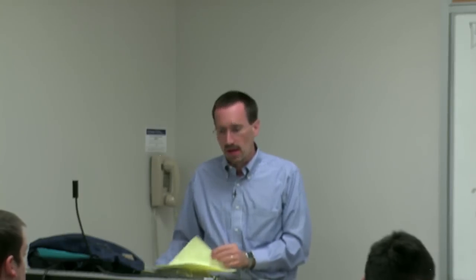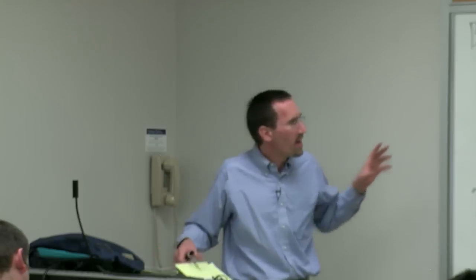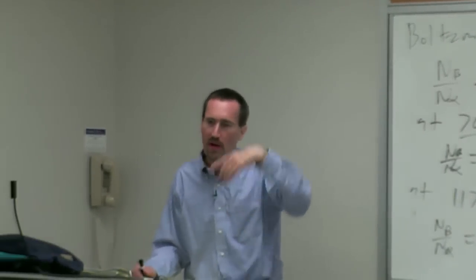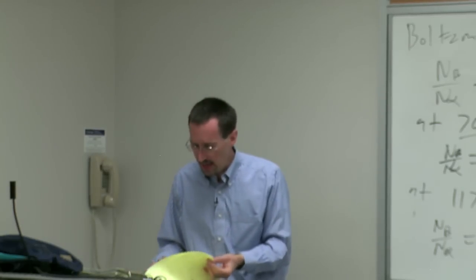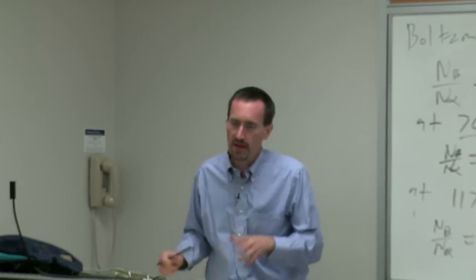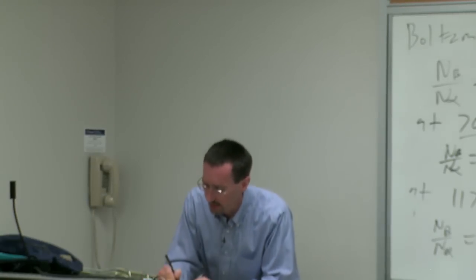And this is why NMR, compared to other spectroscopic techniques, is very insensitive and why it took a long time to develop. Next time, we'll talk about how the NMR spectrometer works, how we absorb our energies, and then how we translate that into a spectrum. And I'll also talk a little bit maybe about some of the aspects of the spectrum.